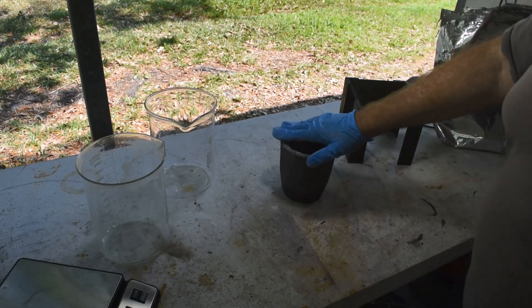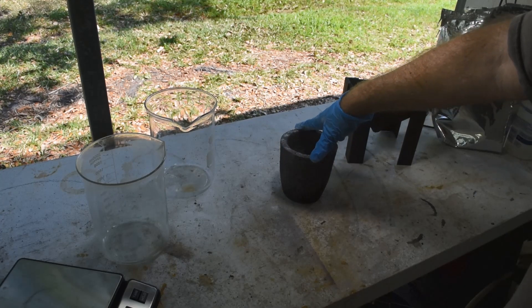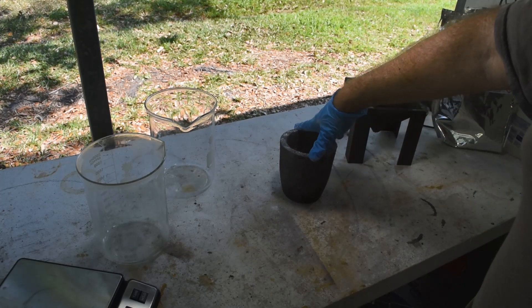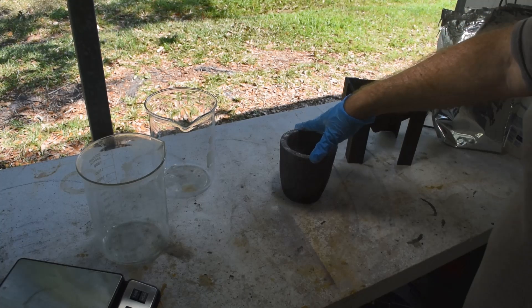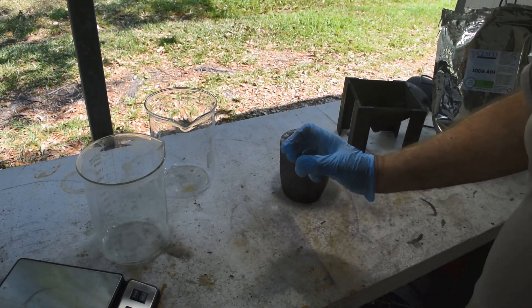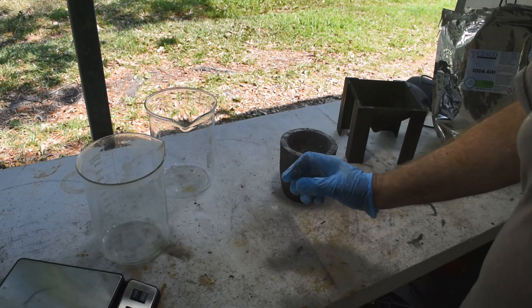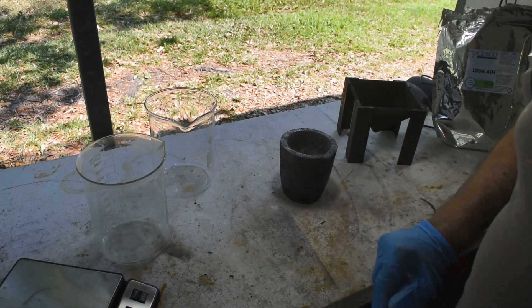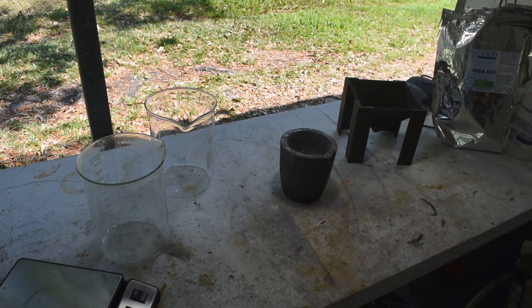What should happen here is the sodium carbonate should react with the metastannic acid. We should produce sodium stannate and free tin — at least, if I understand the chemistry, that's what's happening. I've done this on a small scale in a small ceramic crucible over a torch and got tin out of it. So we'll see what happens on a larger scale and see how much tin we can get out of this. Let's head over to the foundry furnace, get this inside, and get the furnace lit.